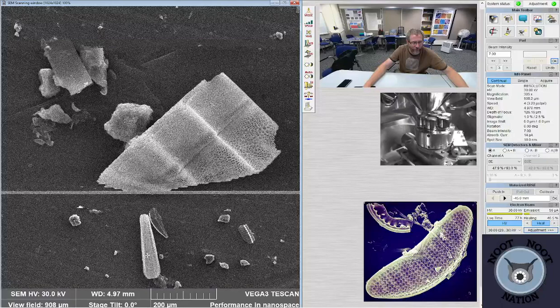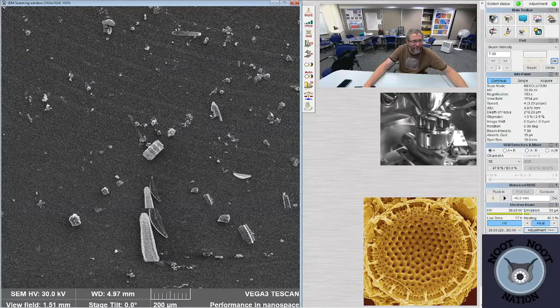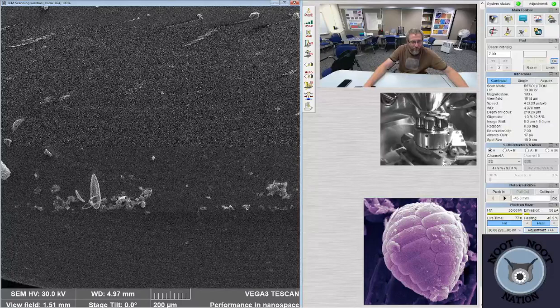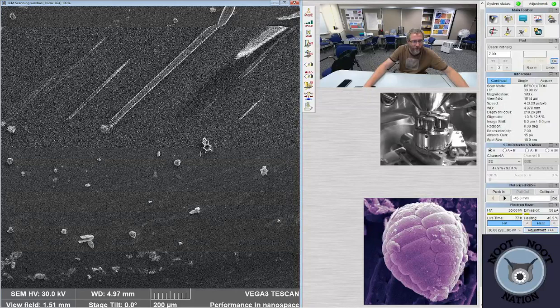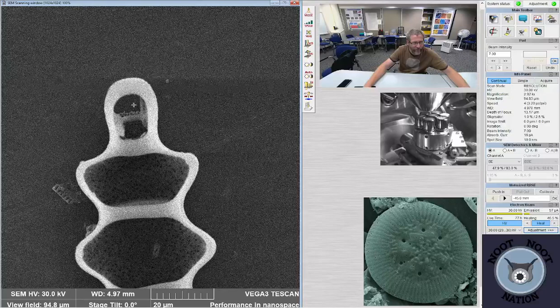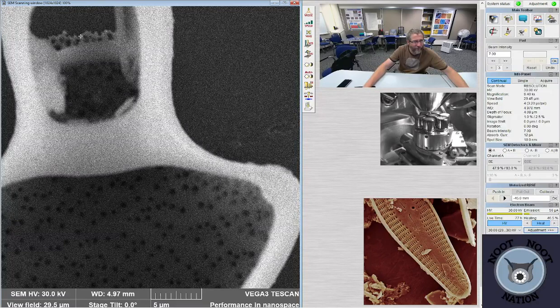That's the one part I kind of wanted to zoom in and take a look at. It's missing, probably because they're the weakest, most lightly silicified part of the diatom. So if you're wondering why all the ends are busted out, it's because the apical pore fields are on there, something called an ocellus, or pseudo-ocellus. This one might actually have its... no, they're broken out. It's busted out again.